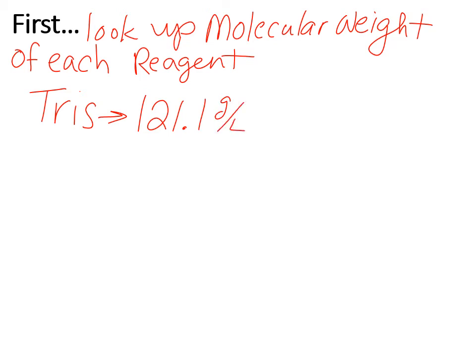But remember, that's the molecular weight, tells us for 1 molar, 1 liter. We don't want 1 molar. What do we want? We want 0.1 molar. Okay, because again, whenever you see 100 millimolar, you move the decimal point 3 places to the left. So 100 millimolar Tris is actually 0.1 molar, because when you do this formula for molarity, where I told you molecular weight times the molarity times the volume you want, you have to stick to molar units and liters.